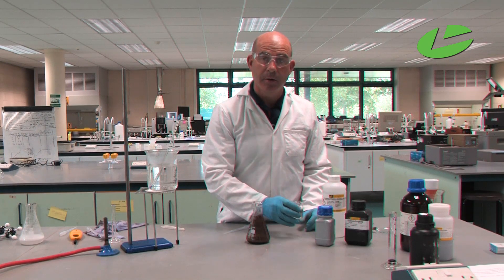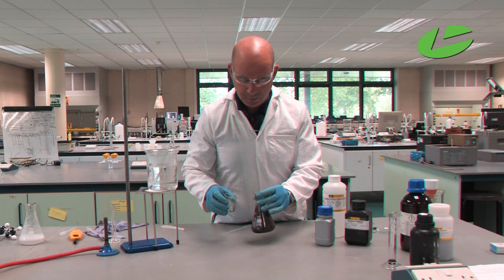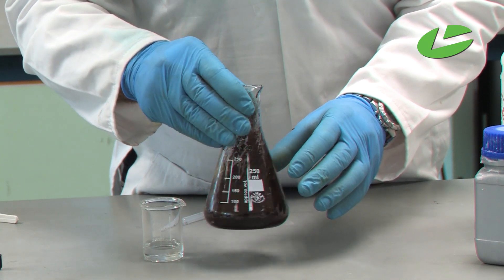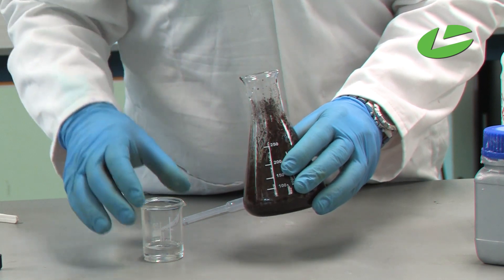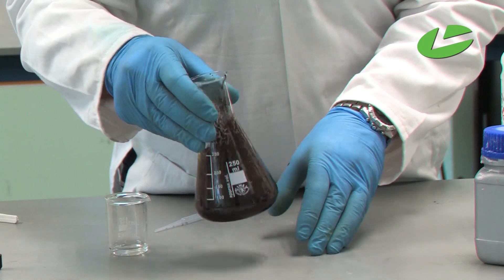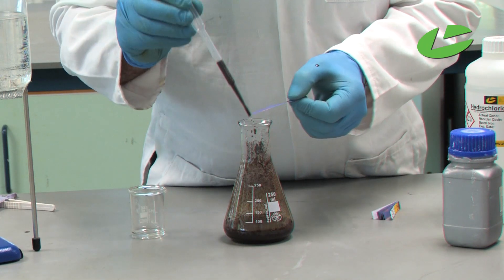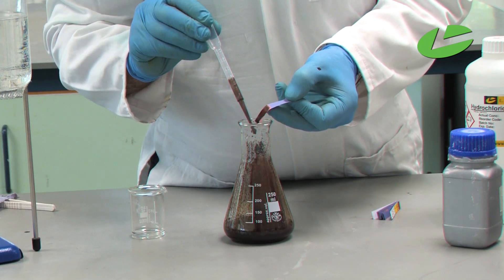I'm going to add in 25 ml of hydrochloric acid to neutralize the base. You get some effervescence — bubbles of gas being produced — then shake. To check we've added enough acid, we use blue litmus paper: take some solution and we see the red color, confirming we've added enough acid at this stage.